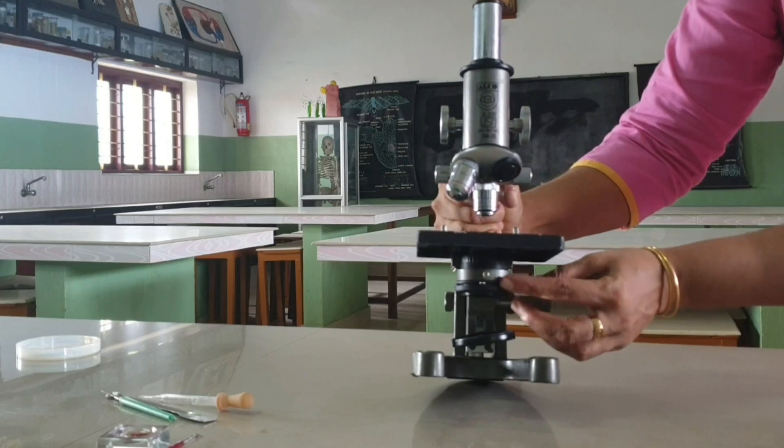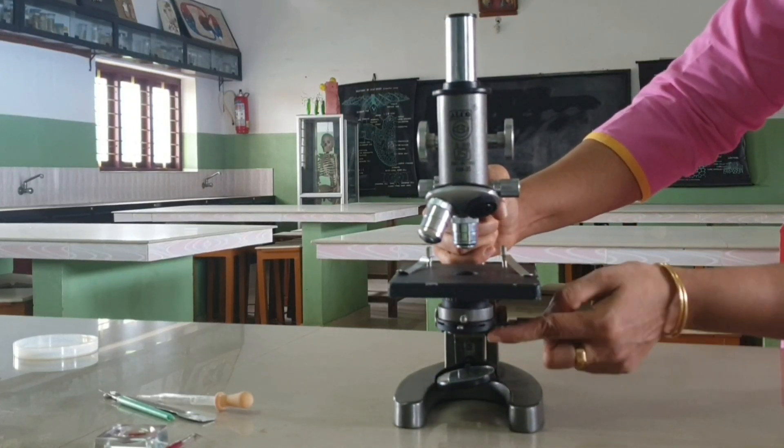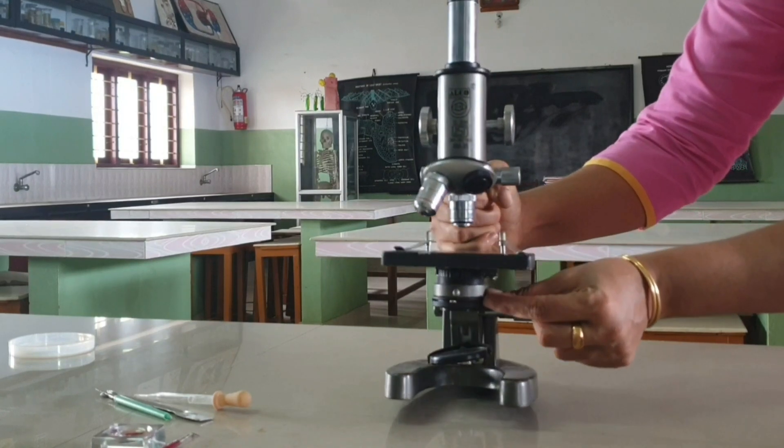Diaphragm: it is attached to the base of the stage and regulates the amount of light entering into the microscope. Normally it is of two types: disc diaphragm and iris diaphragm.